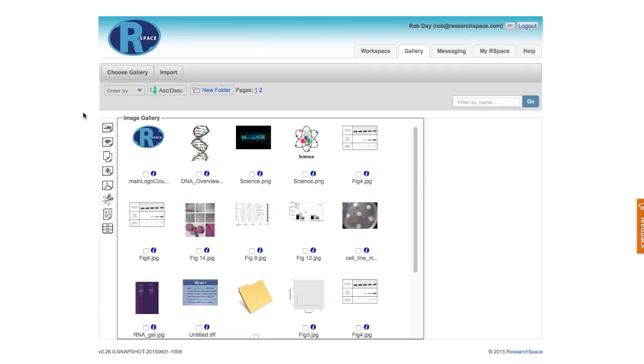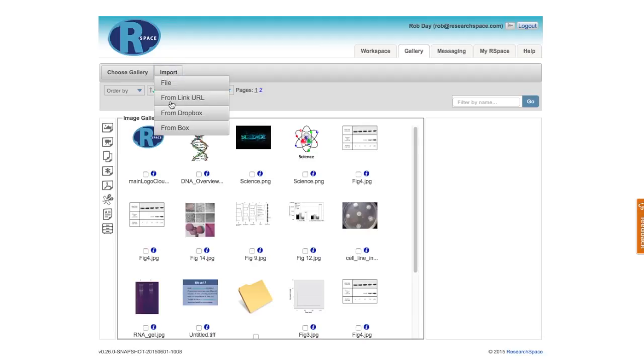The RSpace Gallery is where I keep files that I might use in my RSpace documents. I can drag and drop or import files to the gallery using this menu.